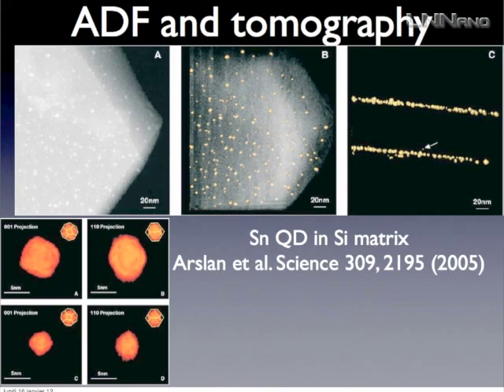Another point which is very interesting with HAADF or ADF is that it's essentially an incoherent signal. There are many ways you can explain what coherency or incoherency is, but the point here is that you have a signal that does not really depend on the crystallography of your sample. So it's especially interesting to use this kind of signal when you are doing tomography, because in tomography, you are not continuously, but almost continuously tilting your sample, and it's most likely that you will have a lot of times your electron beam in the direction of the atomic column.